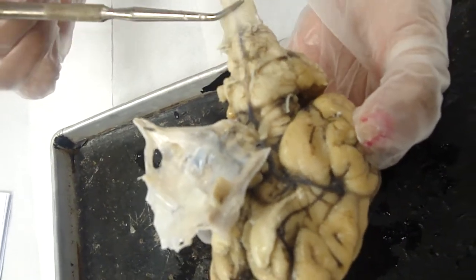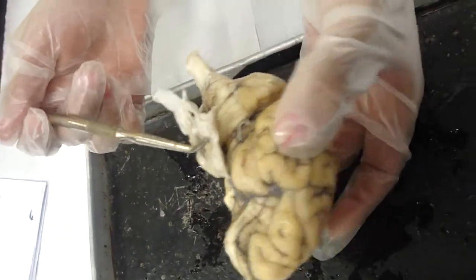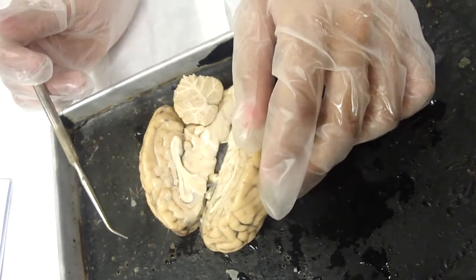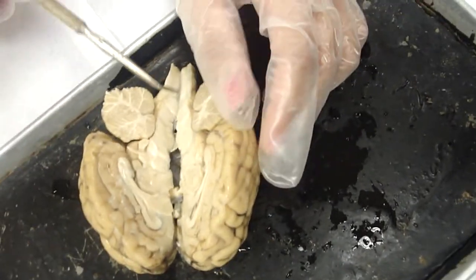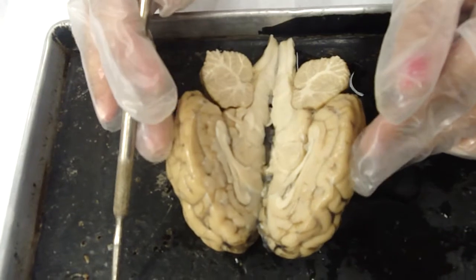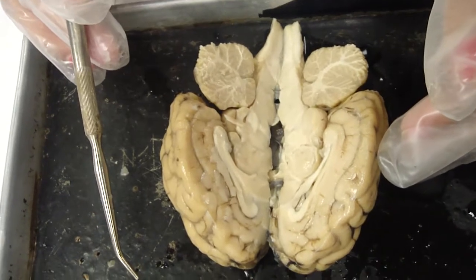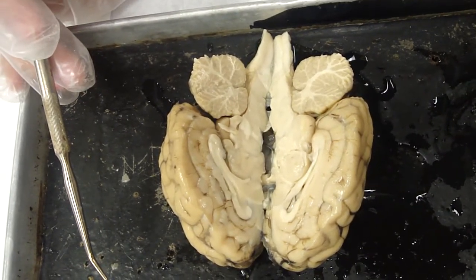Okay, having located those external structures, we're now going to look at the internal structures. We're going to take a sagittal section, so you're going to cut your sheep's brain right down through the great longitudinal fissure. You're going to continue your incision right through the cerebellum and down through the spinal cord so that we fold the brain open into two halves. When you make this cut, you want to do it with a minimum amount of back and forth sawing that you can possibly do. Try to make the cut a nice, sharp, smooth cut, one single cut if you possibly can.